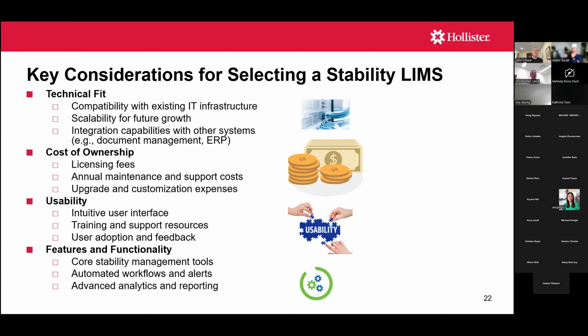This could be another laboratory instrument, perhaps like an HPLC, so it would take data directly from your HPLC software and then dump it into your stability LIMS. Perhaps you have a document management system that you would like to interface with your stability LIMS. ERP system, maybe your company uses SAP. Those are all things to consider.